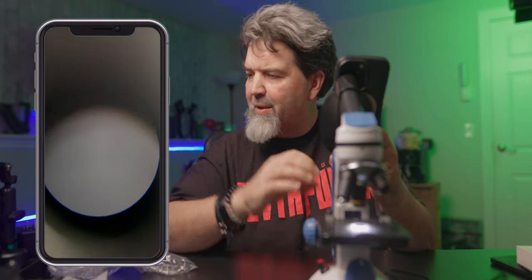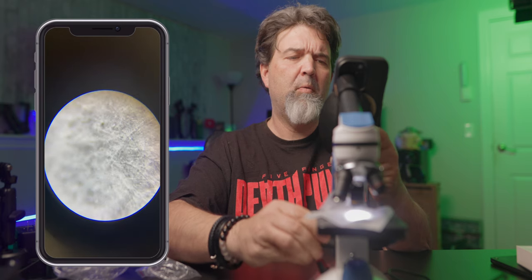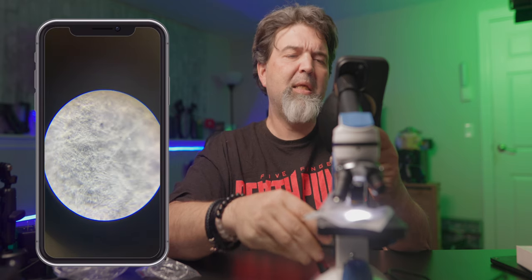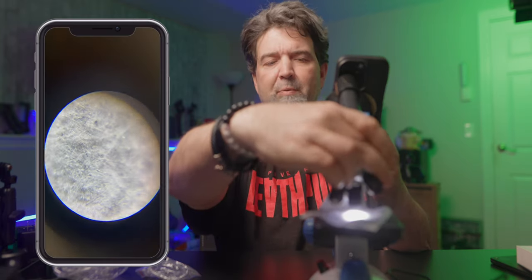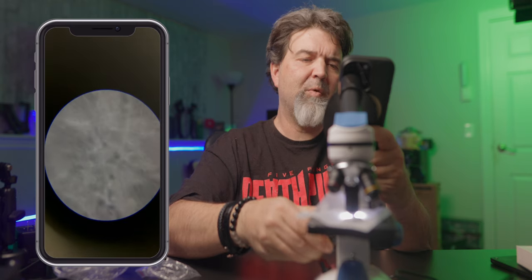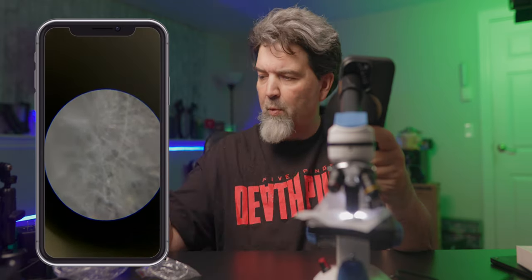Let's try something else - let's try this paper. Going in, going in tight. Now you've got to remember it's not laying flat and it's not in one of those little guard things to keep it level. It would be like if I said hey, I got a cool shot of the moon. That's pretty cool too. Then if we took this and went to craziness - line this up again. You've got to really be tight. Right there, look at that! Can I turn my lights up all the way? It needs a fair bit of light.